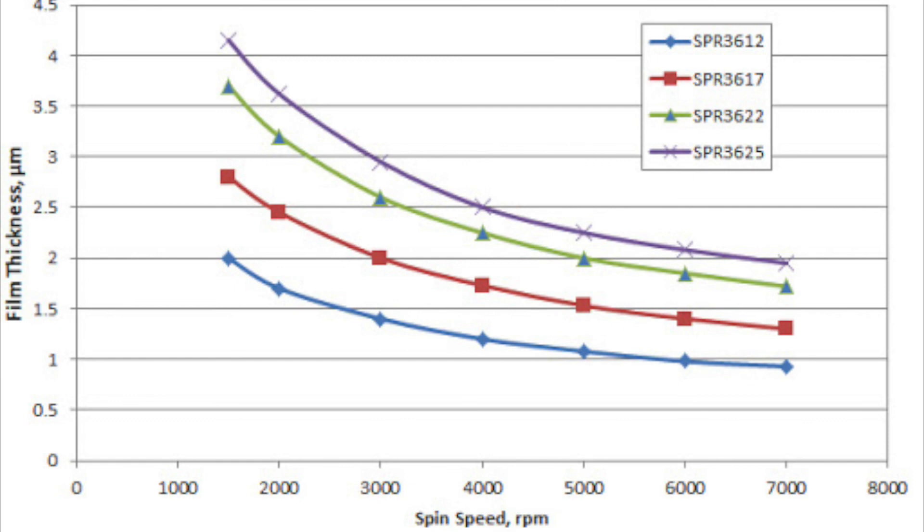One problem you might encounter is streaks in the resist. They usually look like little comets that fan out from the center towards the edge. Most comet-shaped streaks are due to dust particles that land on the surface prior to or during spinning. Avoid moving your arms around which can stir up dust. Step to the right before you hit the spin button just so your body's out of the air path.